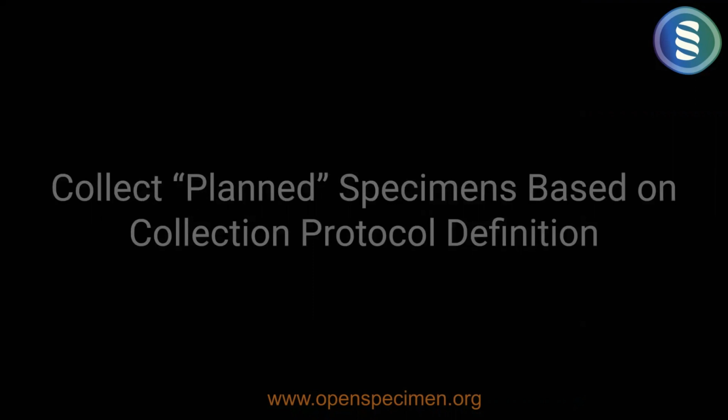As a clinic coordinator, you might also be in charge of collecting the primary specimens, or the mother tubes, or the original tubes, or whatever you call them. That is what we sometimes refer to as planned specimens in OpenSpecimen.